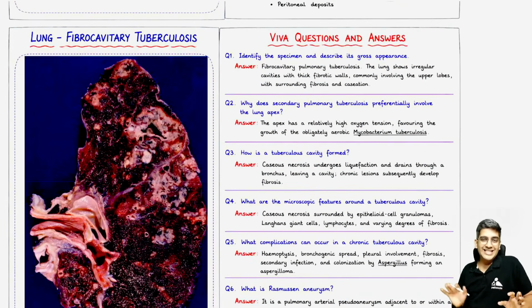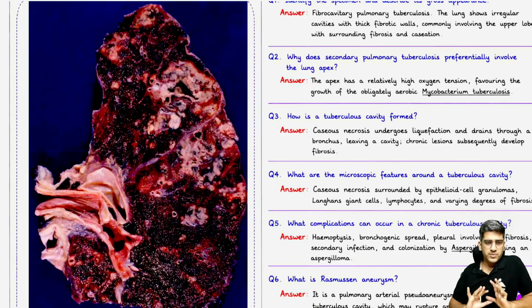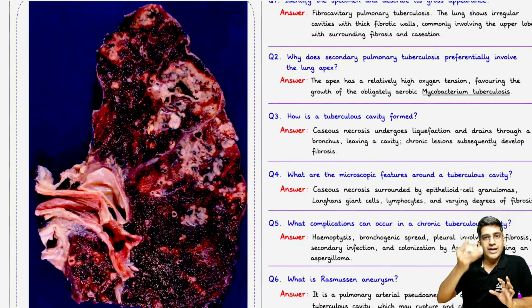Simple guy. Like I said, simple might be difficult, right? So if it's an old specimen or a fresh specimen, it's a jar-mounted specimen of a lung. If you're able to say left or right, say confidently, otherwise ignore. No one cares. Cut bivalve specimen of lung, where you can see the inner bronchus, the hilum, where you can see the vessels in the bronchus, and here in the upper lobe of the lung, close to the pleura.